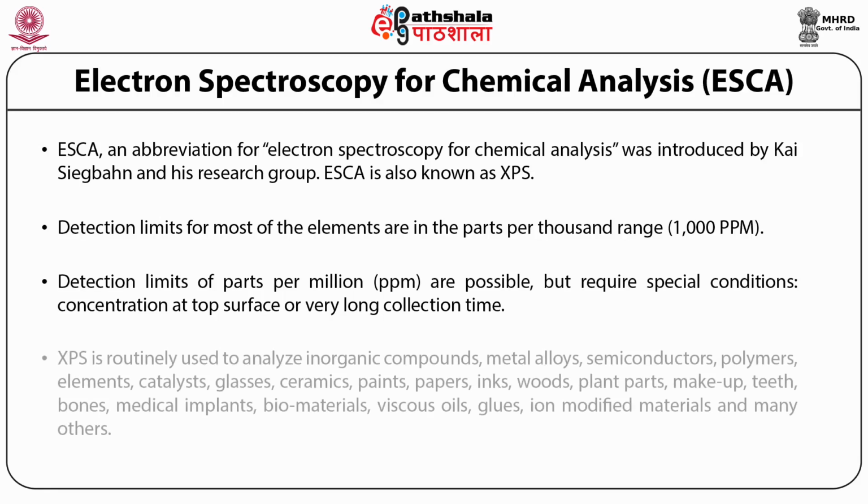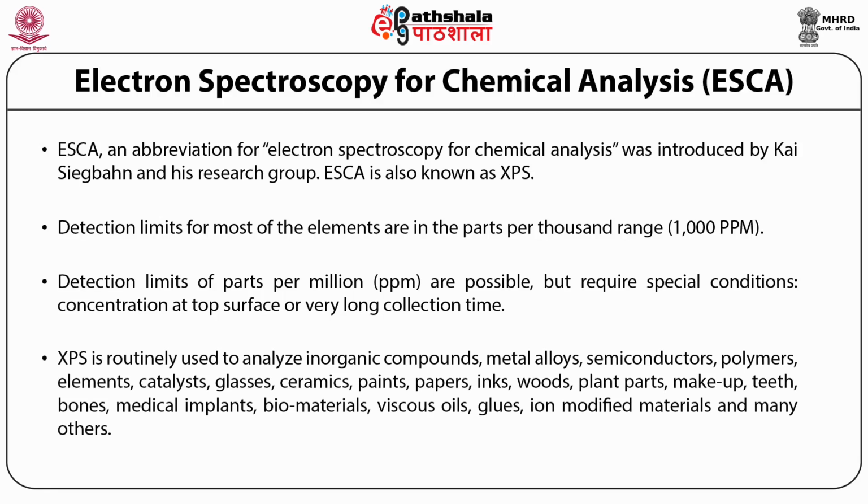XPS is routinely used to analyze inorganic compounds, metal, semiconductor, polymer elements, catalysis, glasses, ceramics, paints, paper, ink, wood, plant parts, makeup, teeth, bones, medical implants, biomaterial, viscous oil, glues, ion modified material, and many others.